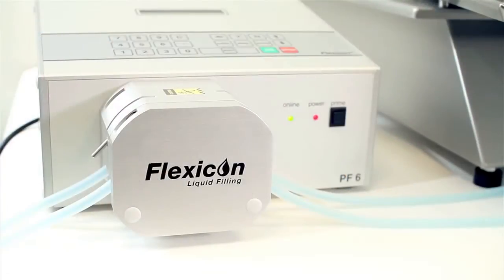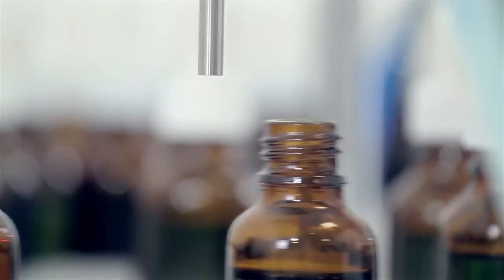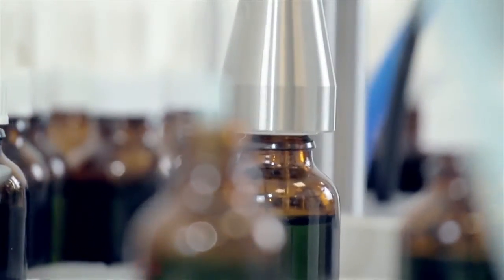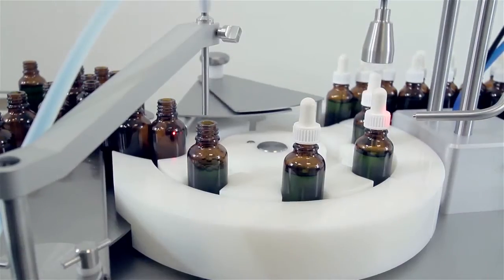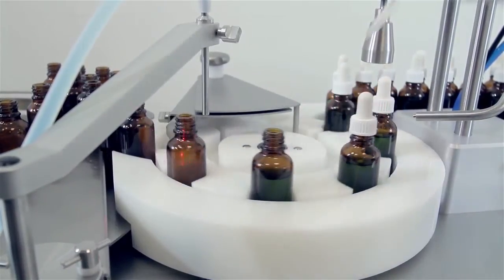Combined with the Flexicon Peristaltic Filler, the FlexFeed 30 is a universal solution for filling and capping up to 1,200 bottles per hour with diameters from 12 to 50mm.